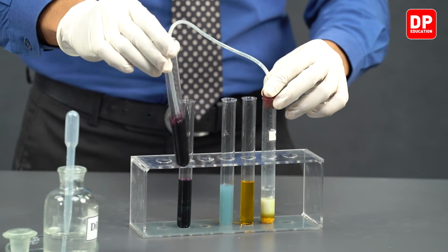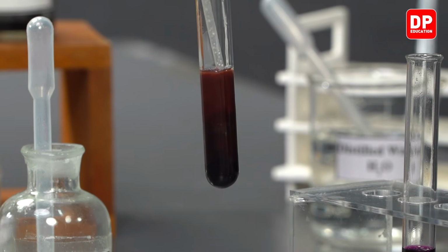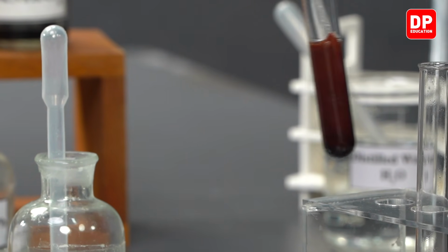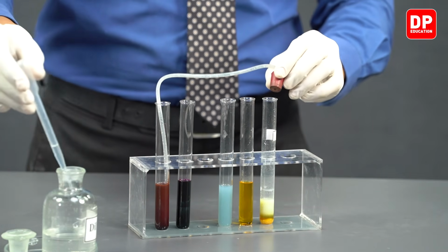Can you observe the color of the acidified potassium permanganate solution gradually decreases? We can add a little bit more HCl to our tube here.